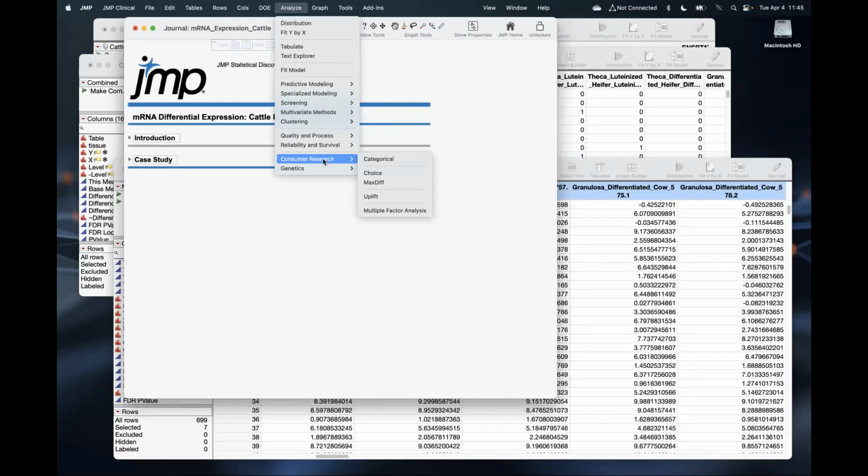And then I'll mention briefly that we can go to fit model to start doing some more sophisticated analyses. Do I have a random variable? Do I have another fixed effect that I want to look at and get out those genotypes that might be most significant, and build even a quick Manhattan plot for that. But we will be continuing on. From a population structure standpoint, you can use PCA. We don't have relatedness measures yet, but that is coming in the next version, different relatedness measure calculations, which means we're going to QK mixed modeling in the next version.